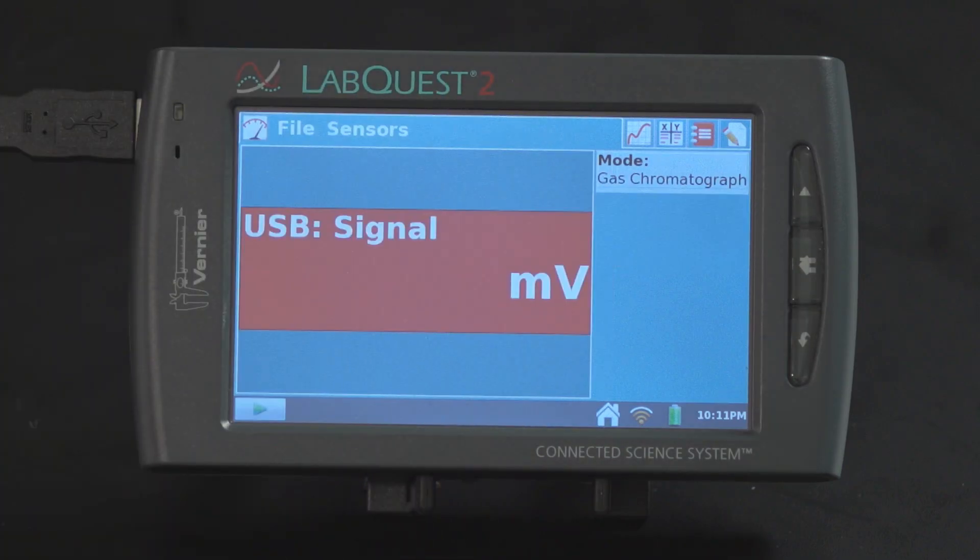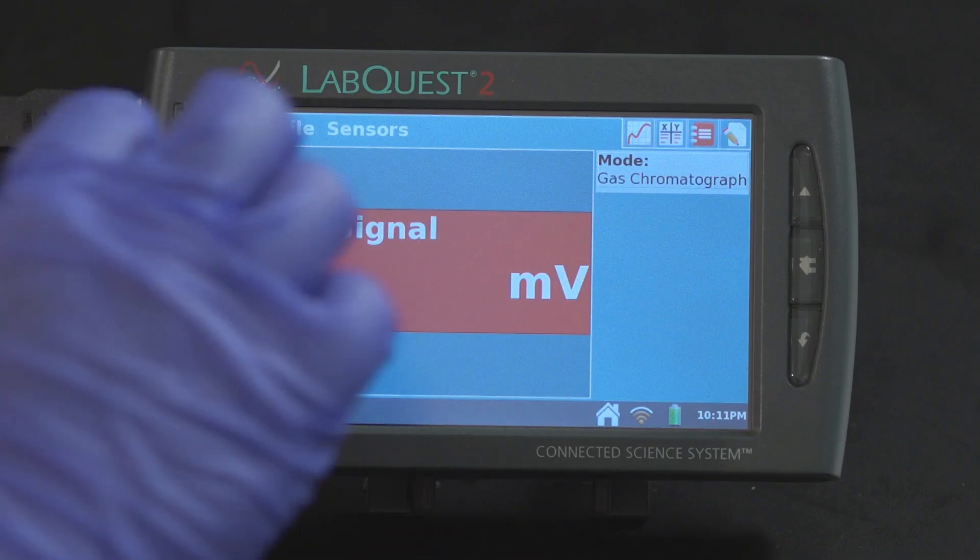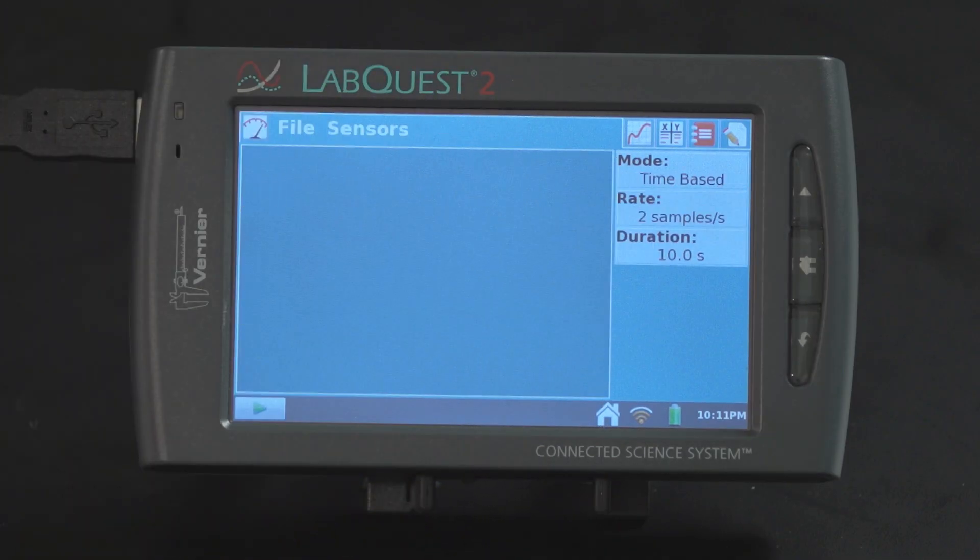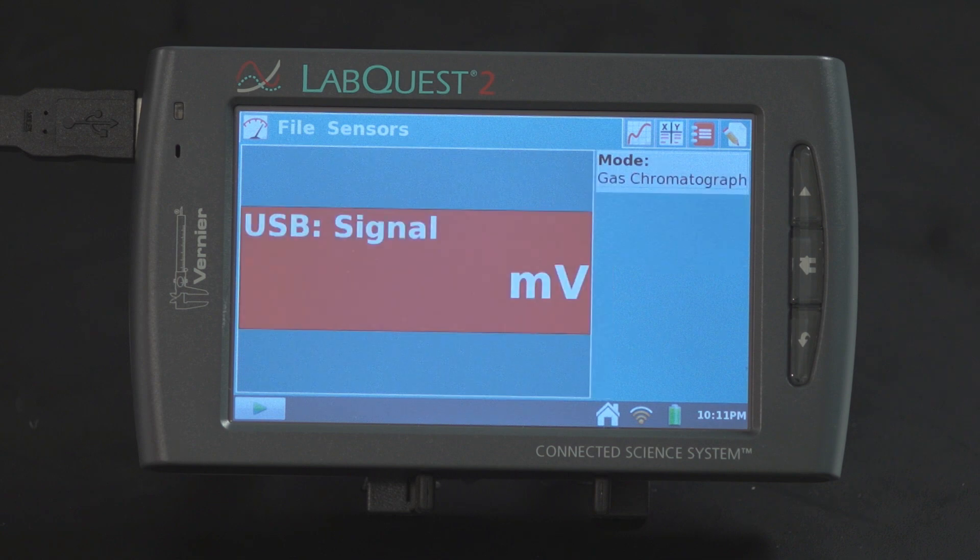LabQuest will auto ID the Mini-GC Plus. Select File, New to ensure software settings are set to default values.